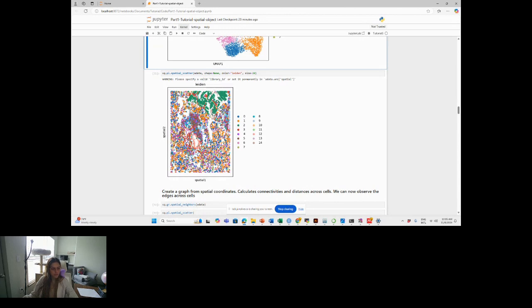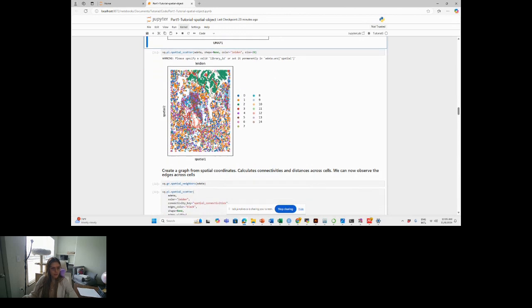However, this information is just using the transcription, right? Right. And the analysis that we are doing includes that we can now make it multimodal. We can integrate it with another data set. In this case, the other data set are the morphological images. And we know that there are also changes in the case, for example, of the tumor cells. There are changes in terms of the size and the shape of the cells when we see a tumor. And that information we hope we can use in order to increase the spatial information that we have for these cells.